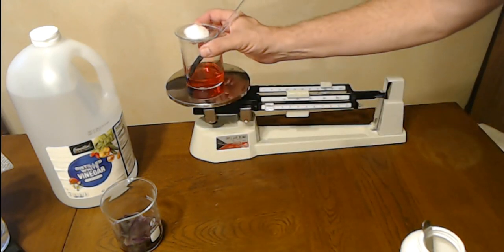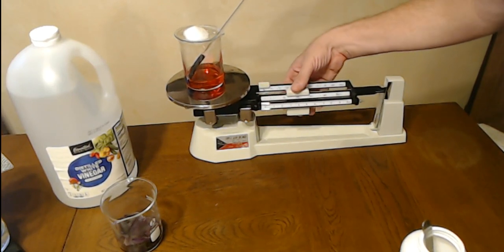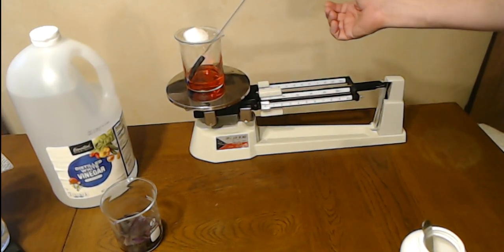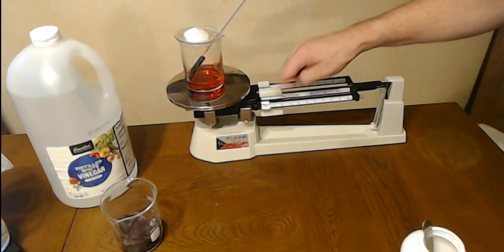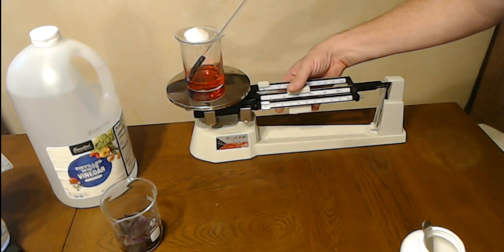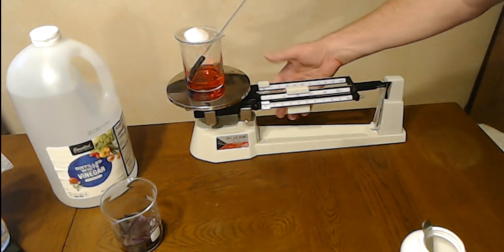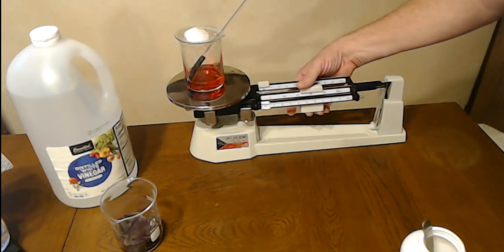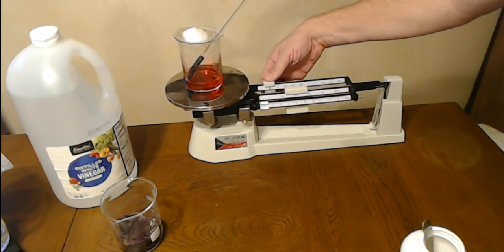We're going to put it on our 3-beam scale here. If you haven't used a 3-beam scale before, the center's 100s, the back's 10s, and the front's 1s. So you start with the 100s, you move it up, not too heavy. What we're trying to do is get this line and this line to match up. That means that it's in balance and we got the right reading. So 200 is not enough, 300 is too much. So we're going back to 200, we're going to go up by 10s.